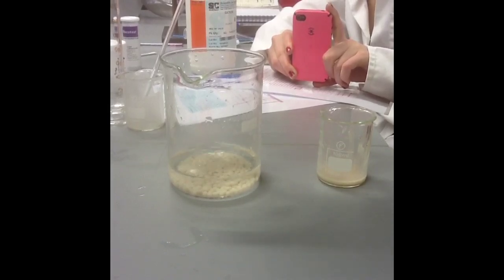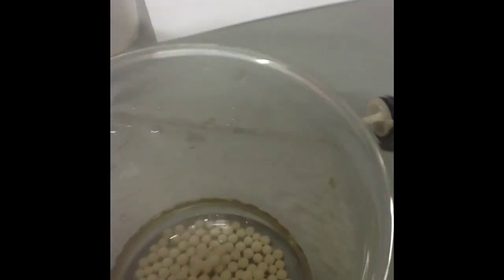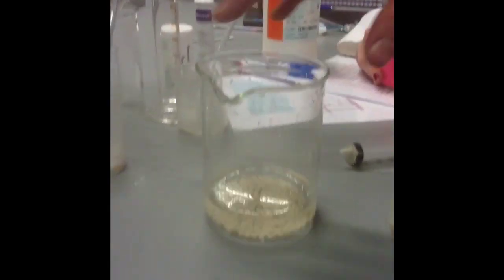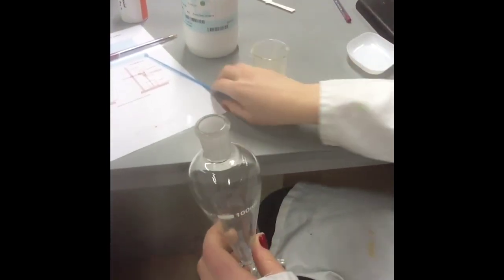While the beads are left to harden, it's important that we create an enzyme which is not immobilized. To do this, we must mix 2g of yeast in 10ml of distilled water and then add this yeast suspension into a separating funnel labeled free yeast.